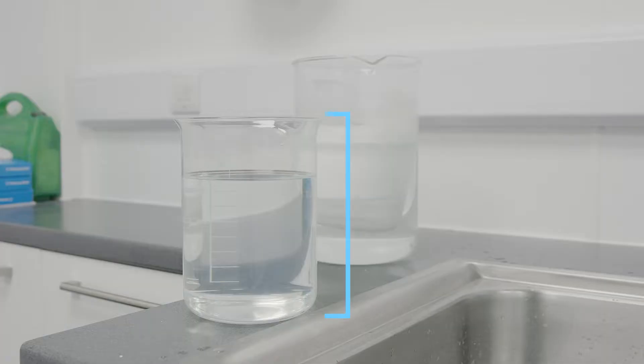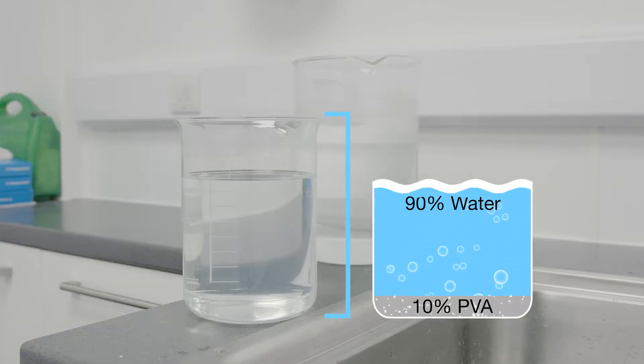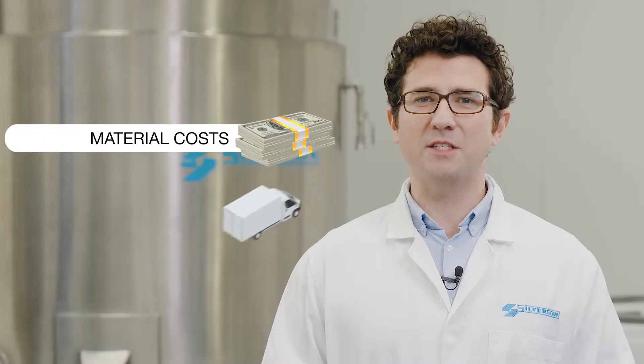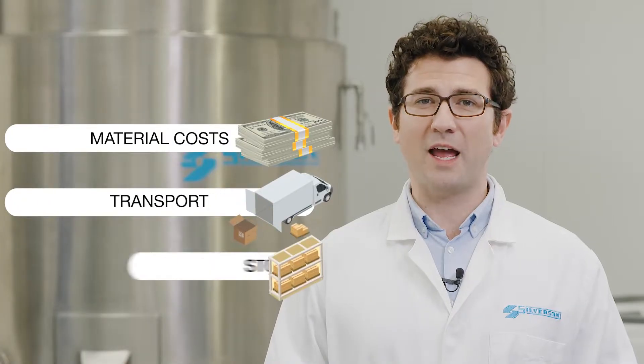It can be supplied in liquid form, but its concentration is normally a small percentage of PVA in water. Many users prefer to prepare their own solutions due to savings in material costs, transport, and storage.